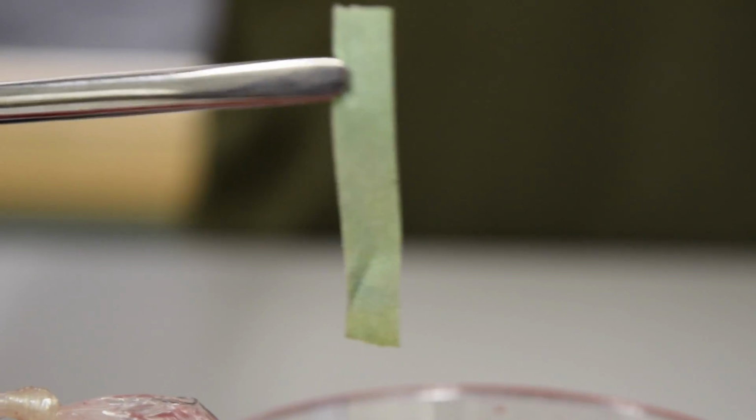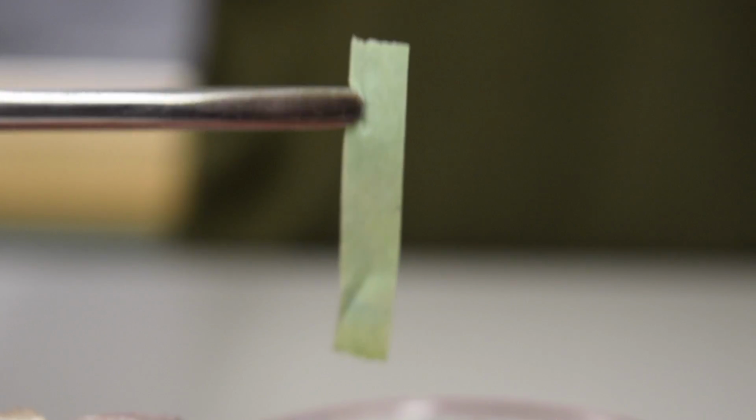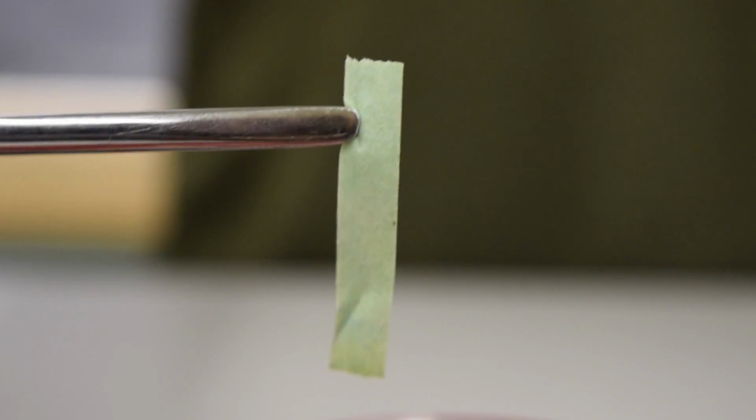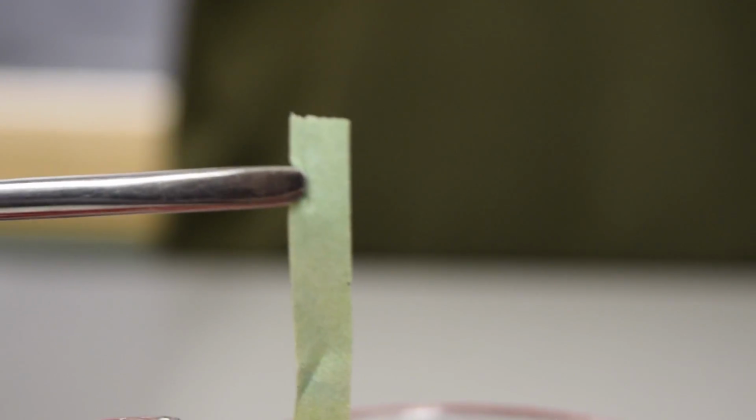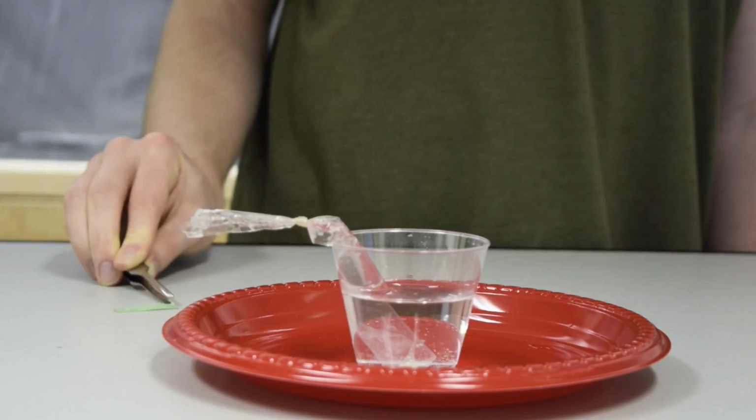If students' test strips are not turning green right away, make sure they wait a few minutes before testing with another glucose strip, because it may take some time for the strip to turn green.